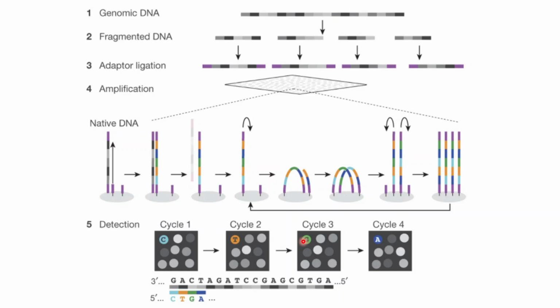And then after doing quality control, if you are confident that this has been done properly, you have to assemble the whole reads either to a reference genome that we know, or we have to do a de novo assembly, meaning that if you don't know a reference genome, then we assemble it by doing an overlap match of the reads, and from that generate the whole length of the sequence or the genome sequence that we are looking into.